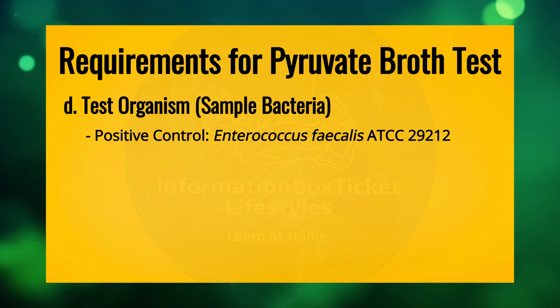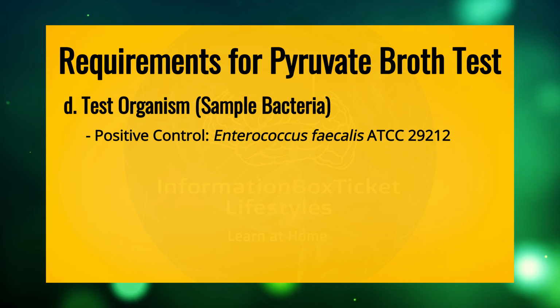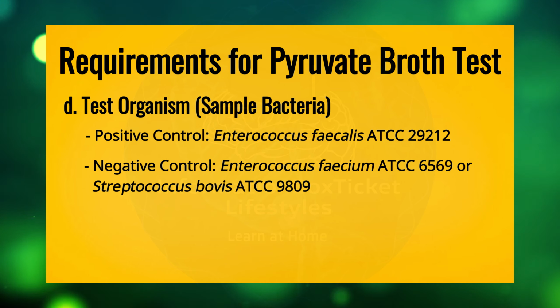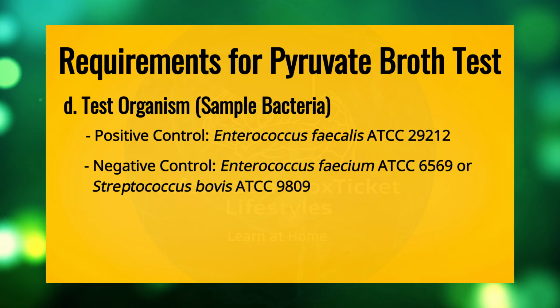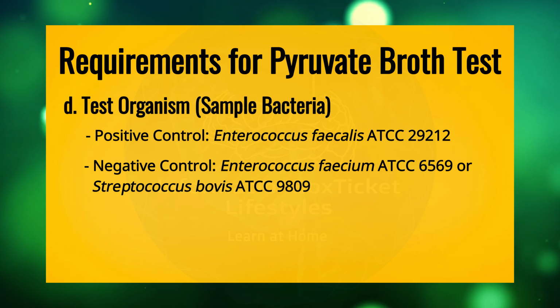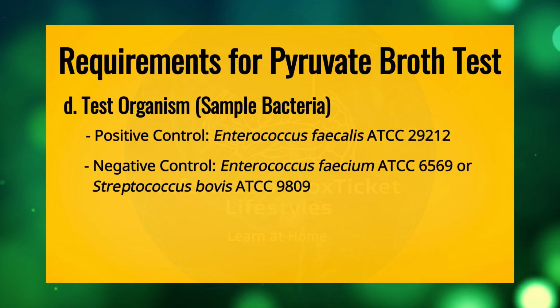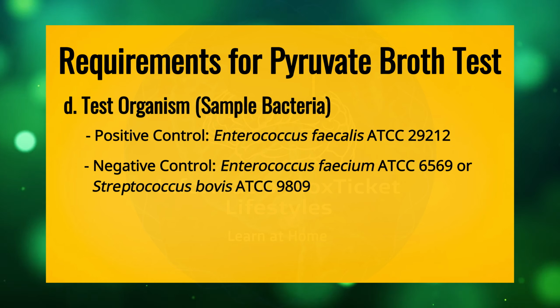Positive control, Enterococcus faecalis, ATCC 29212. Negative control, Enterococcus faecium, ATCC 6569, or Streptococcus bovis, ATCC 9809.